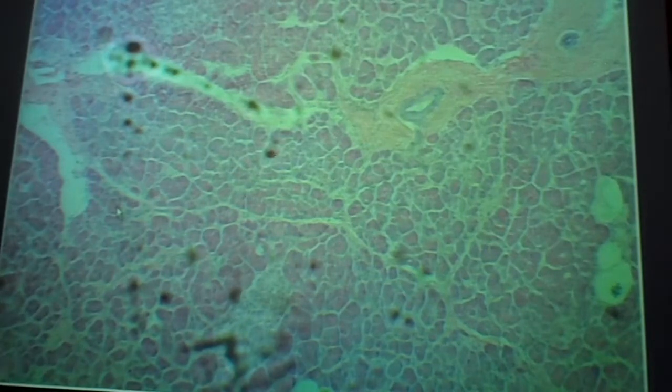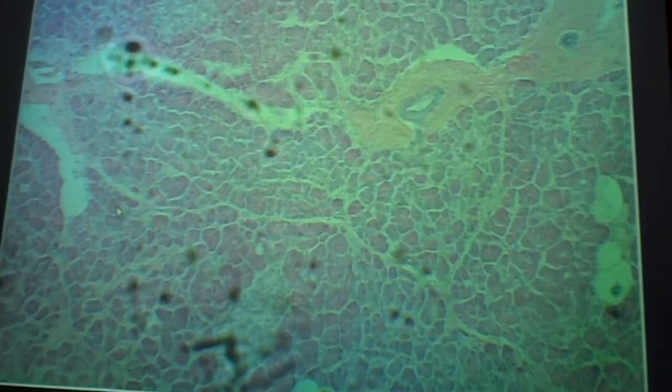No, we just did liver. No, this is pancreas. This is pancreas. That's it, last but not least. They all look the same after a while. That's why I leave the labels exposed.